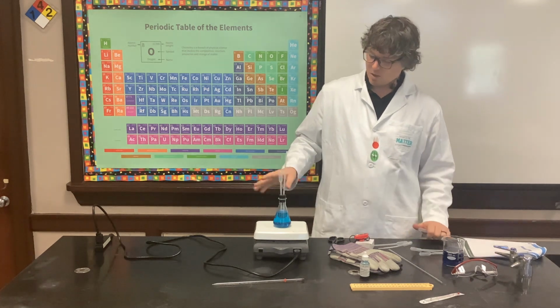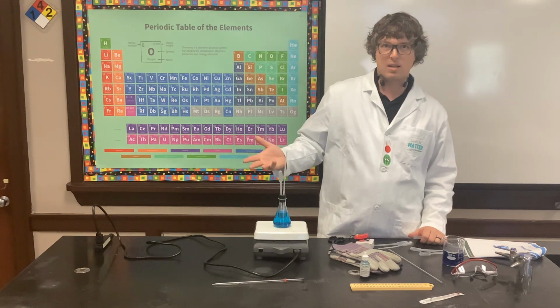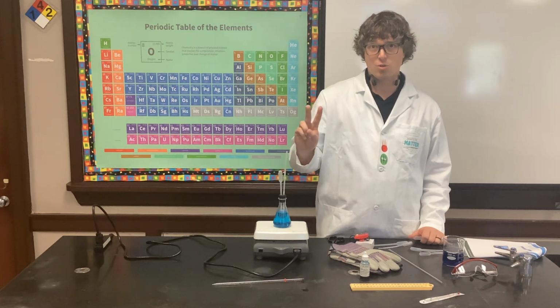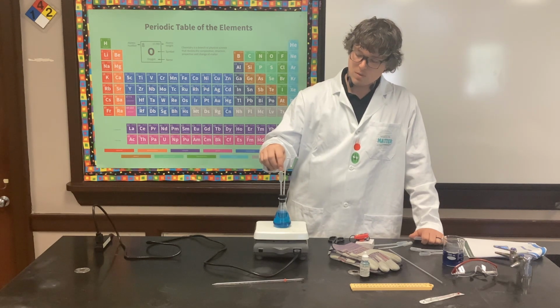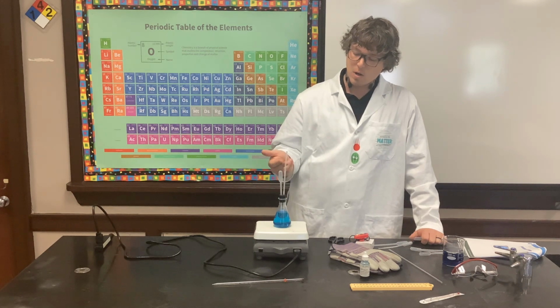Now, I'm not going to make us wait for the water to heat up and for you to see it rise, although that is the point of the lab. Do make sure that, as all the stoppers I found had 2 holes, you're going to have to at least cover one of those up. For my purposes, I just put another pipette in there to plug it up, and that does the trick. The water will go up just the one tube because this is sealed off.